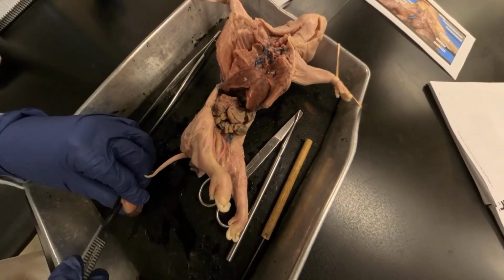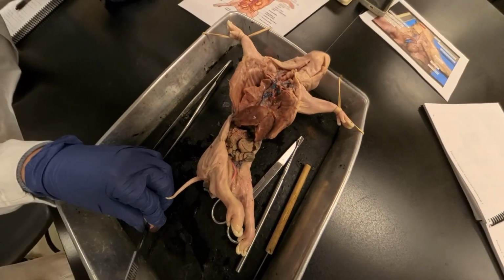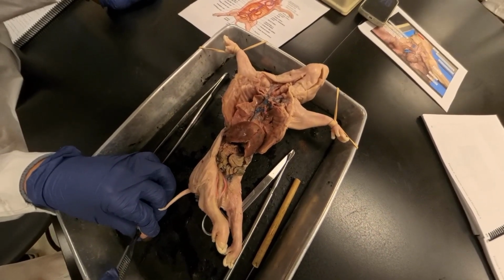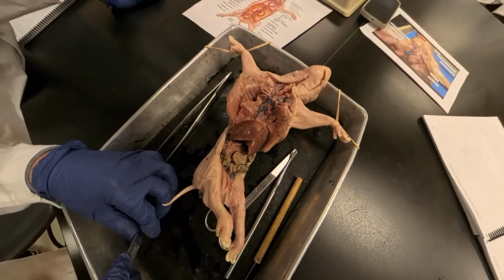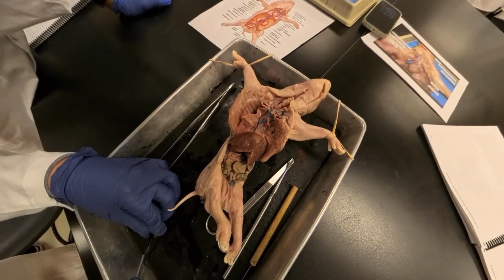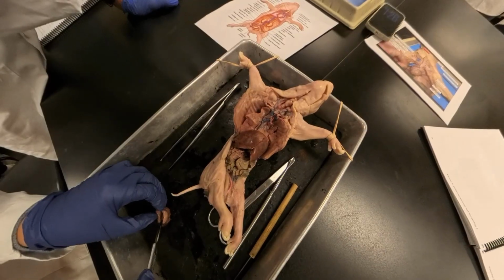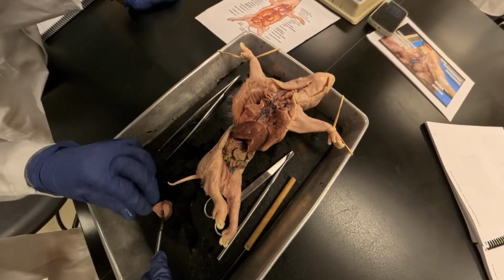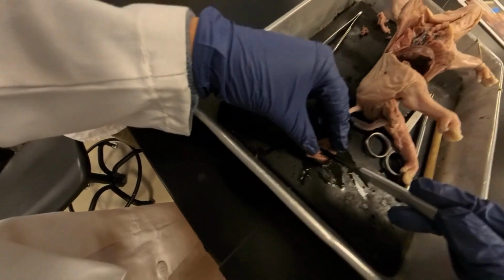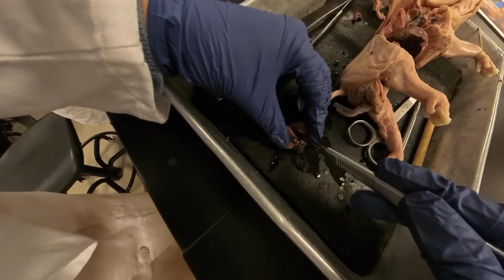Currently, we are cutting the heart in half to check out the foramen ovale, which is a small hole that allows the blood to travel from the right atrium to the left atrium, bypassing some of those pulmonary structures that aren't being used in the fetal pig before birth. And that ovale hole should be located between the right atrium and the left atrium.